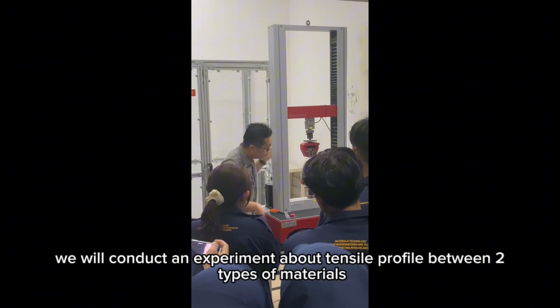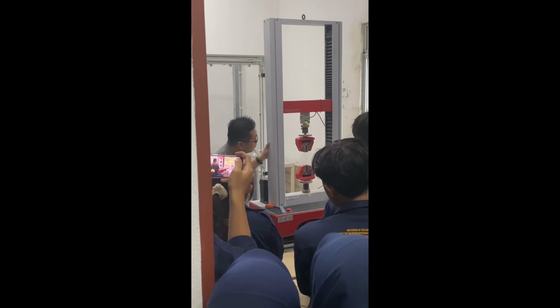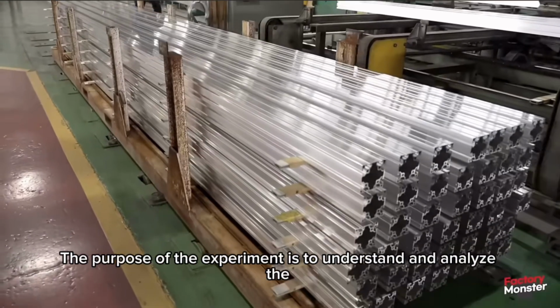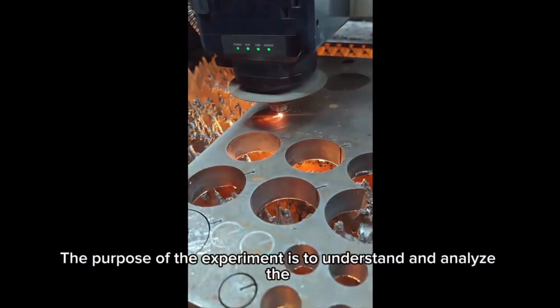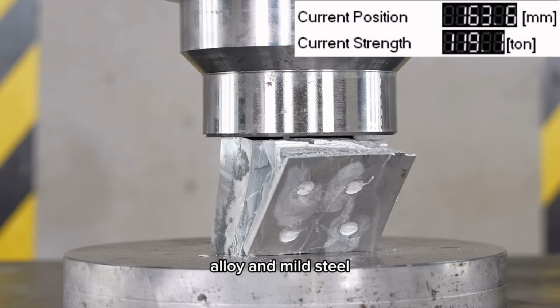We will conduct an experiment about tensile profile between two types of materials, which is aluminium alloy and mild steel. The purpose of the experiment is to understand and analyze the mechanical behavior between aluminium alloy and mild steel.